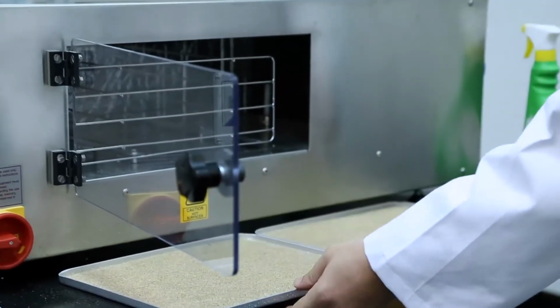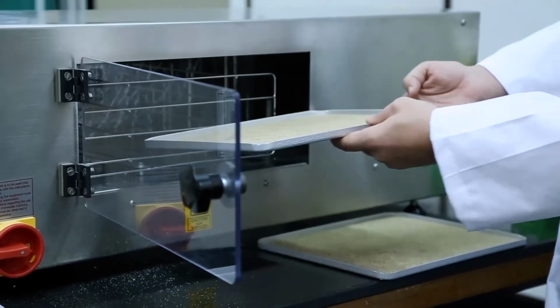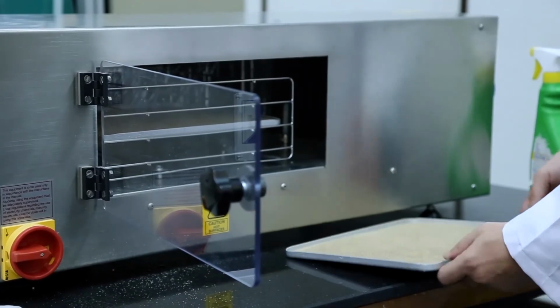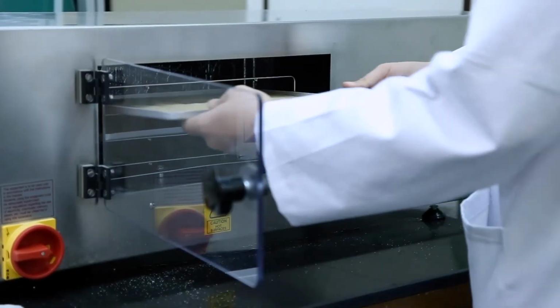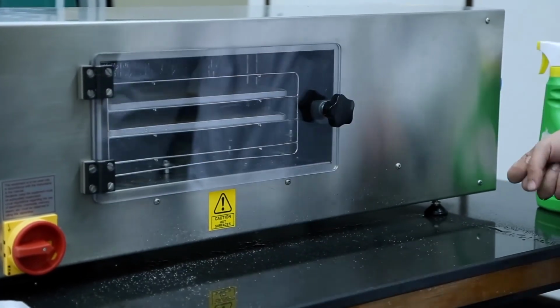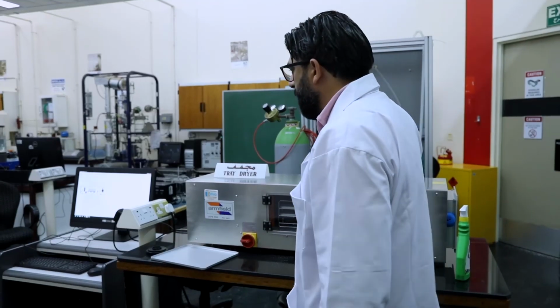We can put our trays in. Okay, and then back again to the software.